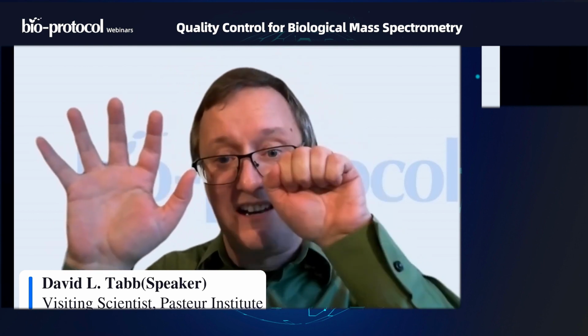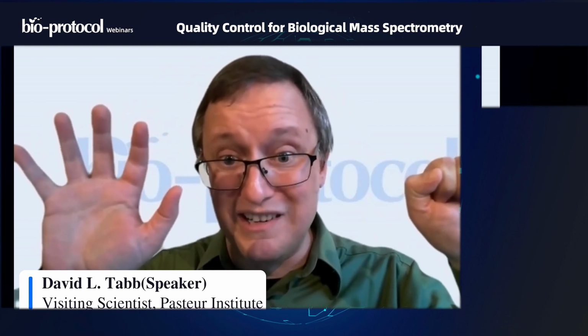Okay, so I would say if you're going to do a quantitative difference test in a shotgun proteome experiment, it's probably best to limit your questions to ones that can be answered at the protein level, not the peptide level. It is not completely unreasonable to throw out the proteins that have missing values. Note that you could have a protein that's present at very high values in these 5 replicates and appears not at all in these 5 replicates. That protein could be thrown out under a rule like that. So best to keep in mind some of the negative effects of that.